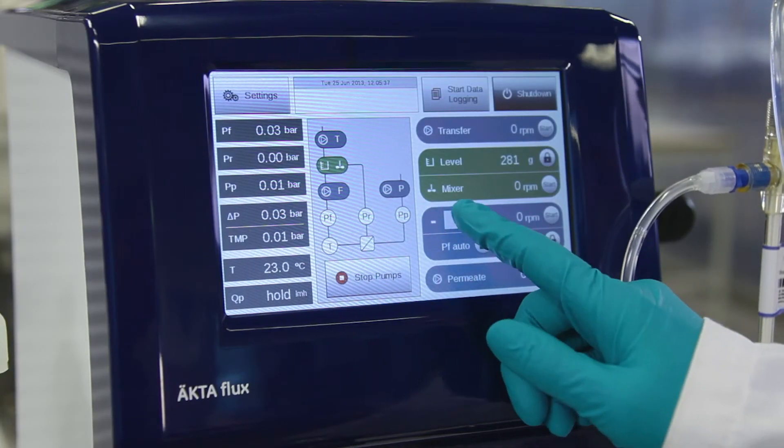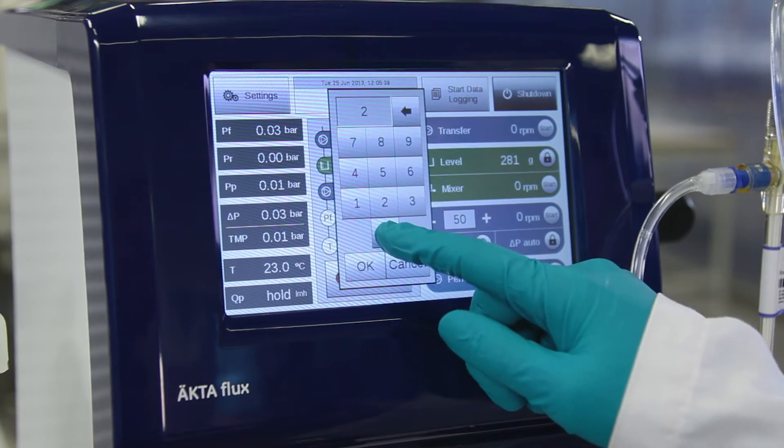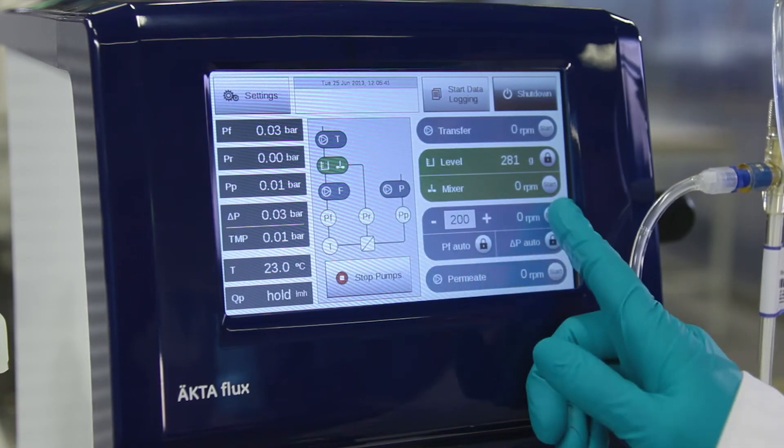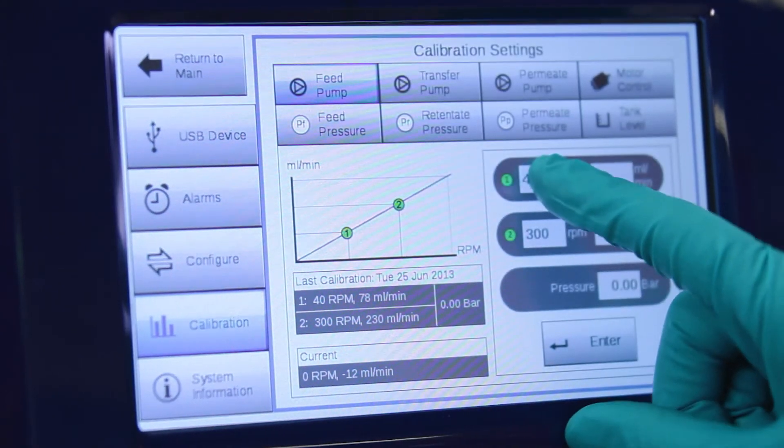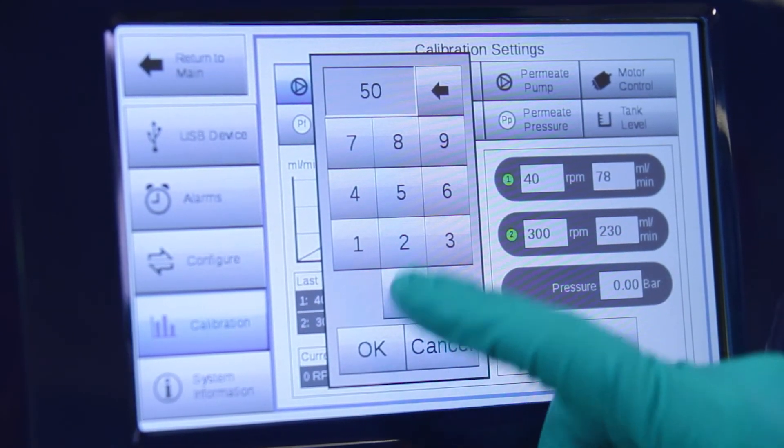Repeat the flow recording but now at a faster pump speed. Press settings and calibration on the touchscreen, then enter the speed in RPM and calculated flow in the calibration view.